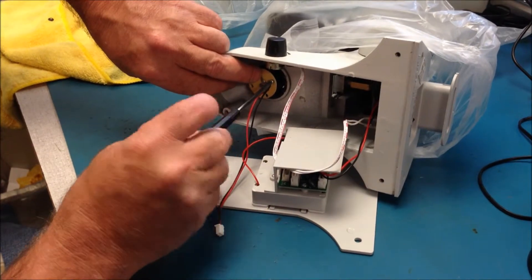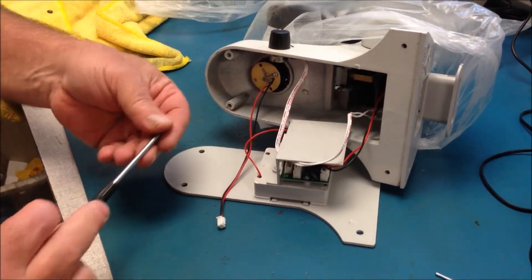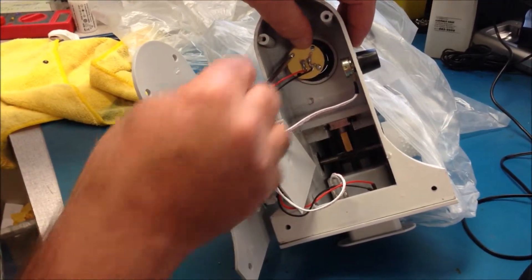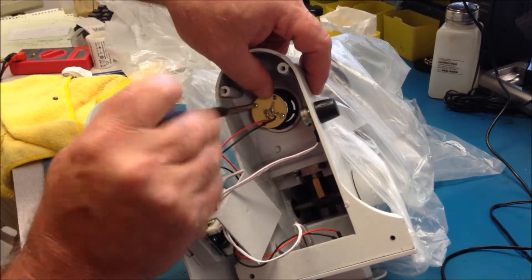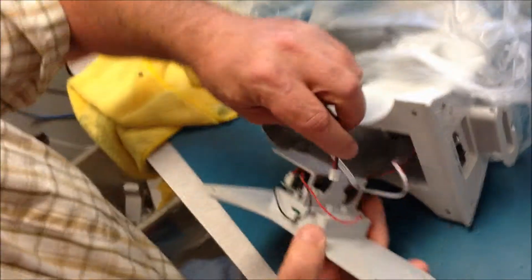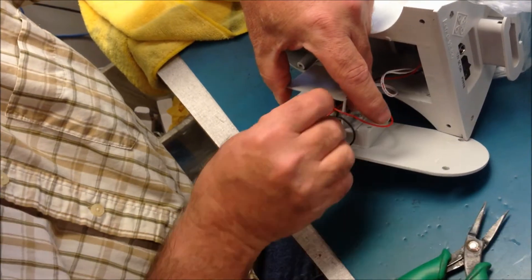Take the two screws and secure the new board back in place. Finally, connect the red wire positive and the black wire negative to the board. Then you will put the base back on the microscope.